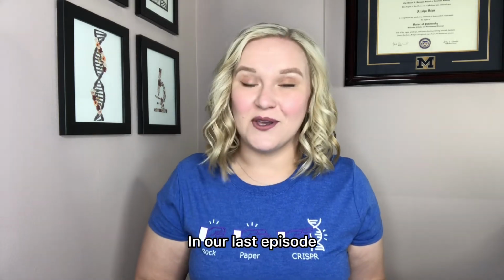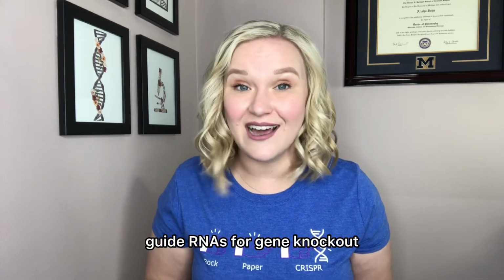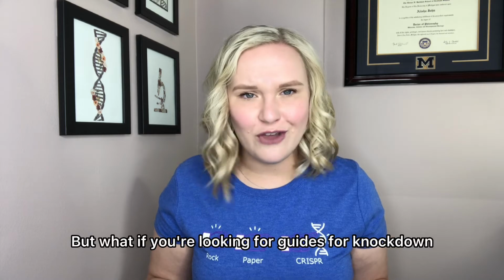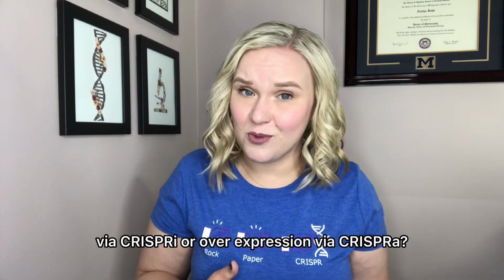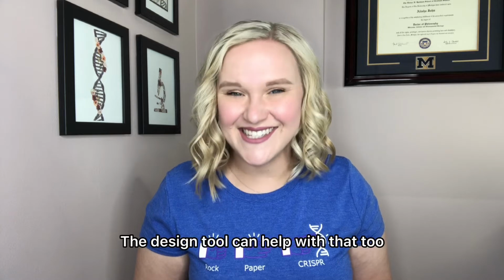In our last episode, I showed you how to use our design tool to find guide RNAs for gene knockout. But what if you're looking for guides for knockdown via CRISPRi or overexpression via CRISPRa? The design tool can help with that too.